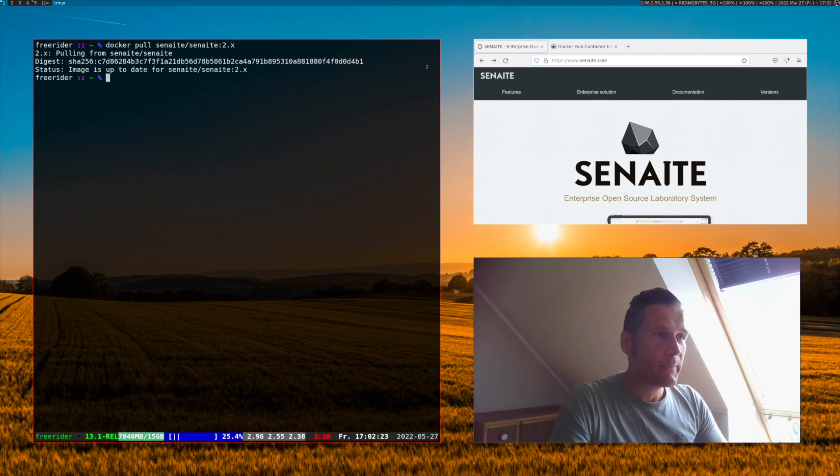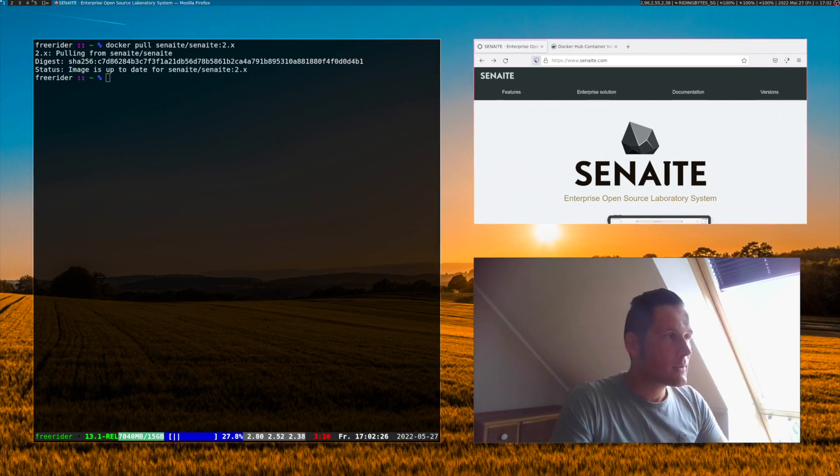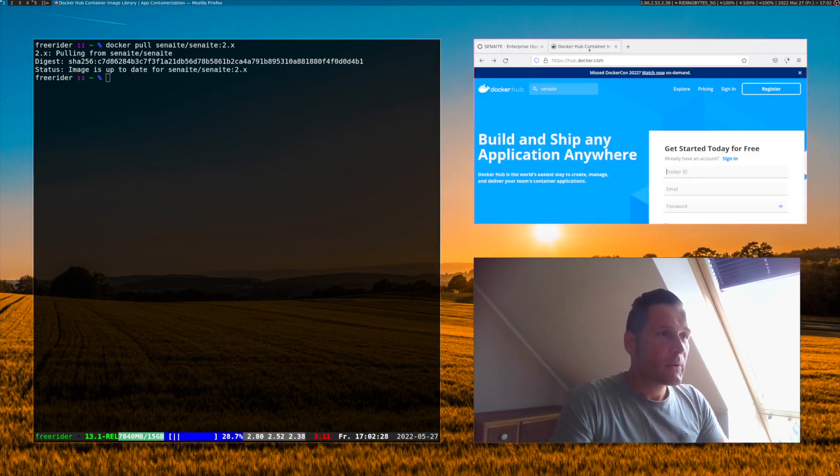Eventually we have it already. So there are no updates here. Everything is fine.